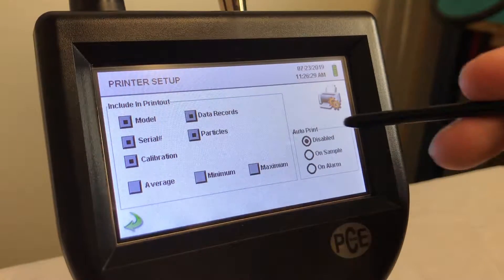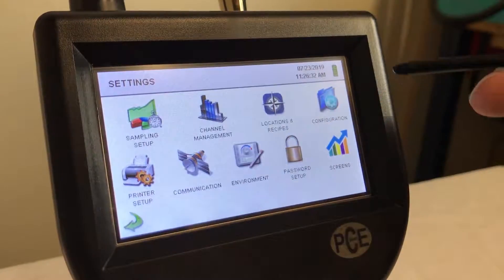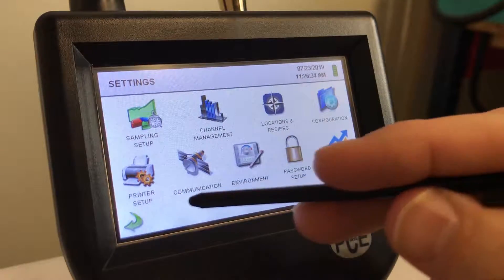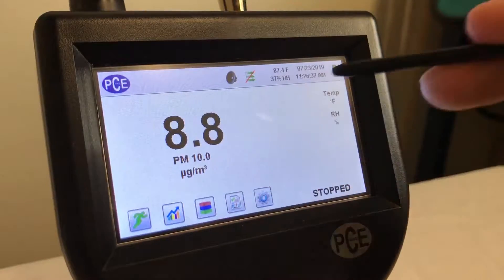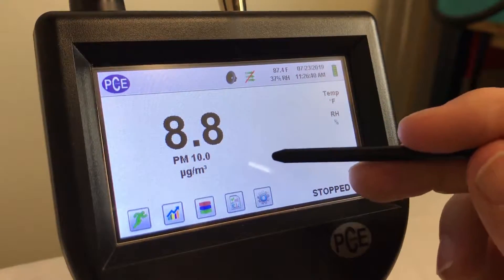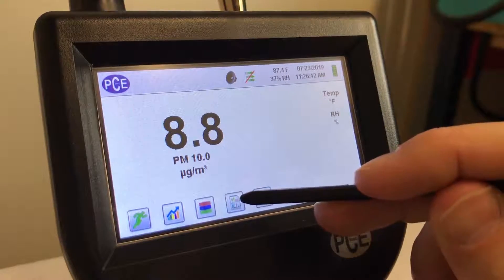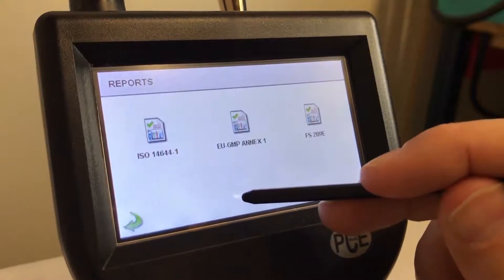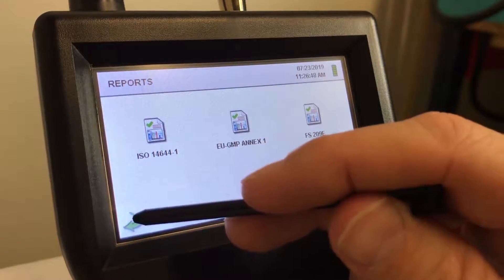Here's your printer setup. And then here's your main screen. If you want to run reports or ISO reports, you can select that there.